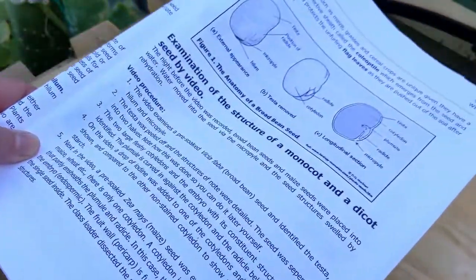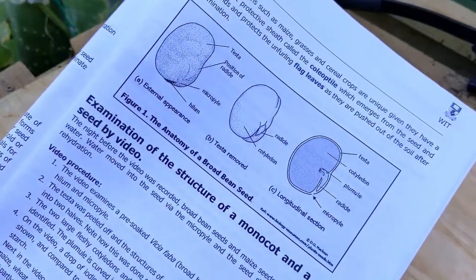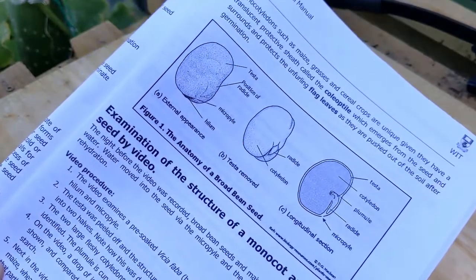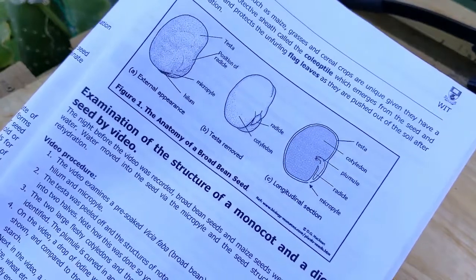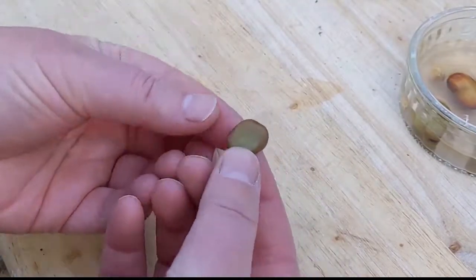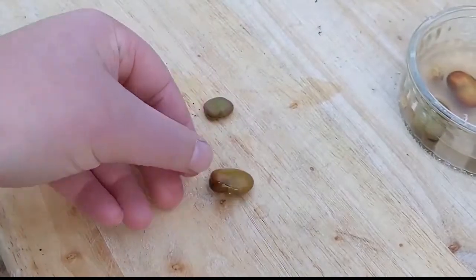For this video it would be really helpful if you opened your manual and took a look at this diagram — a diagram of the external and internal anatomy of a broad bean seed. One of the first things to notice is the size of the seed before and after it has been put in water.